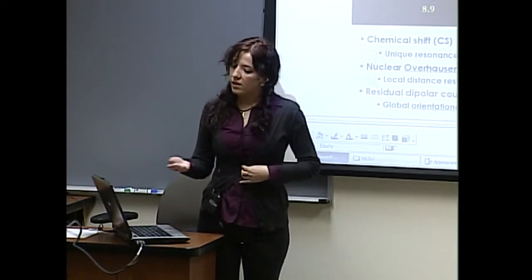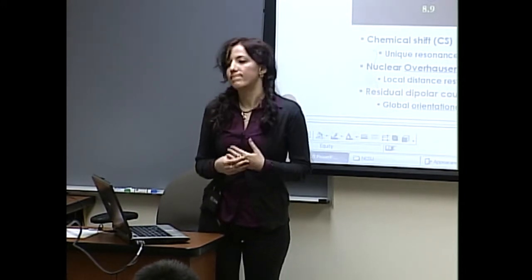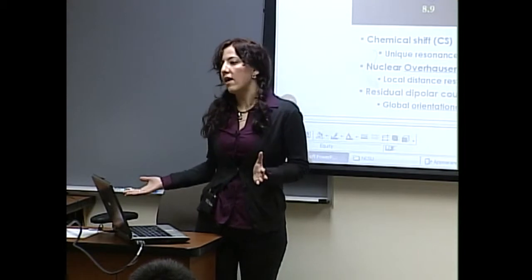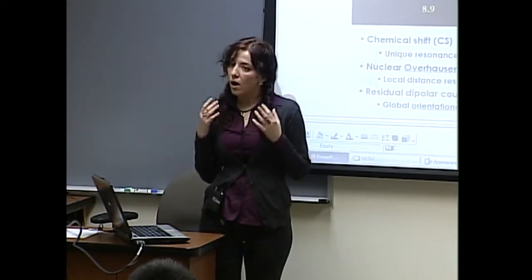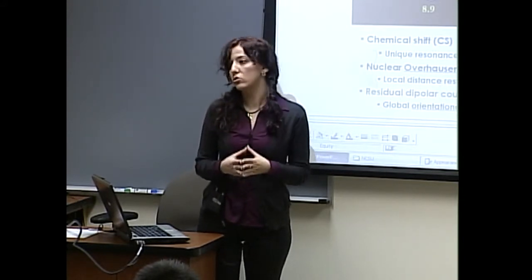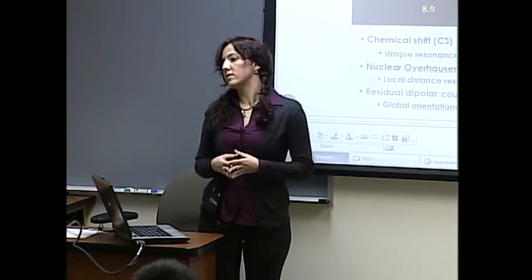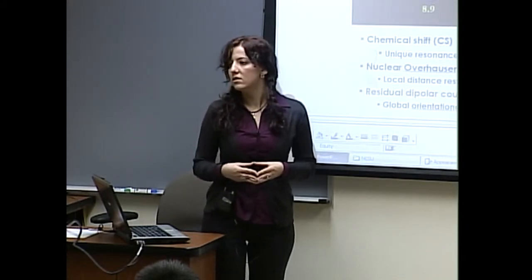However, what you're talking about is more structure prediction, and that's what you have to do if you don't have any other data. We do have the data, and we want to know how the protein is folded in this particular solution. So how do we do that? Of course, we have to base it on our data.